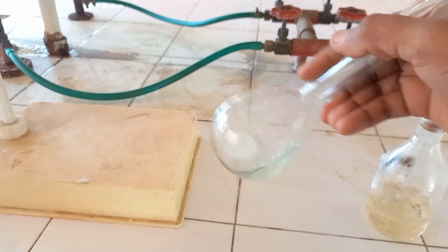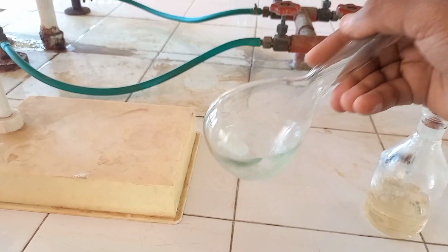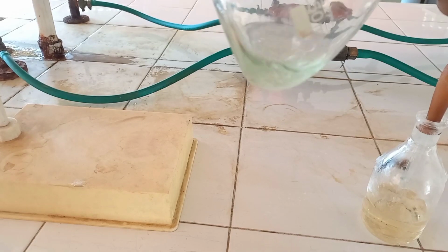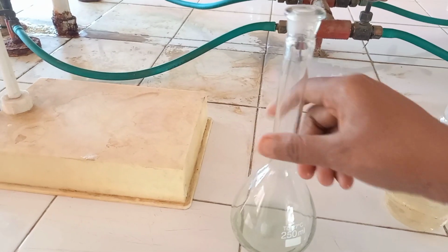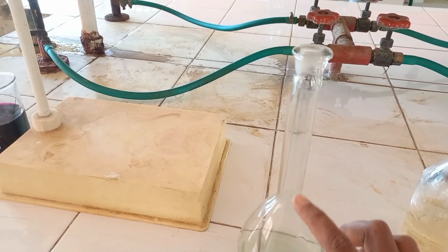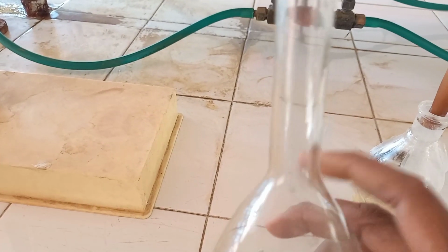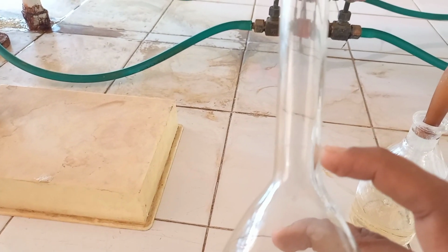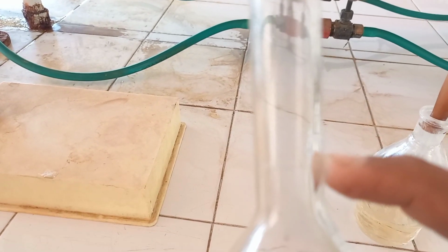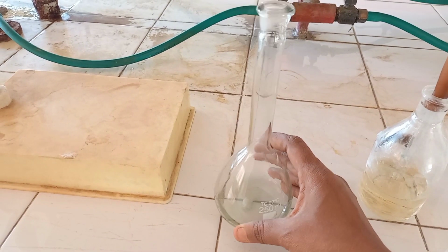The first thing is that you all have to dissolve the salt into the water carefully. After dissolving the salt into the water, you have to make up the volume up to 250 ml. For that, on every standard flask, one mark is always given on the neck of the flask. On this flask, you can see that the mark is given, so I will make up the volume up to that mark. When I make up the complete volume, then this standard solution will be prepared.